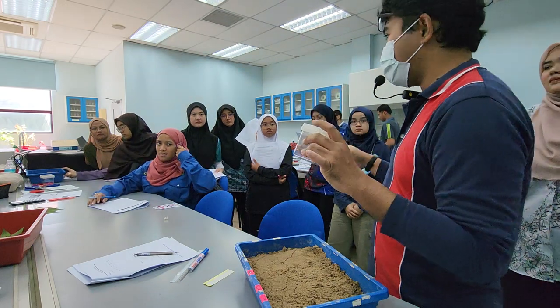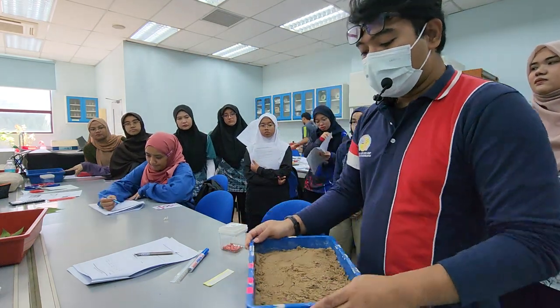Okay. You know that this is poison. Please wash your hand after this, okay? Because you don't have a glove on you. Okay. So, get this.